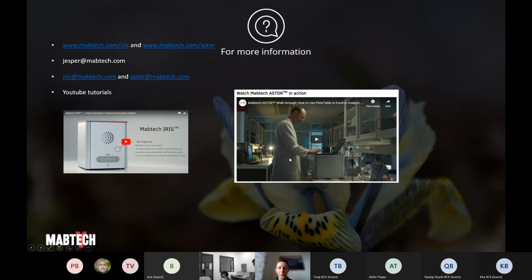And here is also one video dedicated to Mabtech ASTOR, and that's a walkthrough on how to create pivot tables in the Excel generated by Mabtech Apex. So this could be good for slightly more advanced users that quickly want to organize the data that they have collected from maybe one or several plates. It's a nice feature in the Excel where you can use different kinds of customized fields to create your own pivot table. So this is something that I'm going to show you briefly on Monday as well.